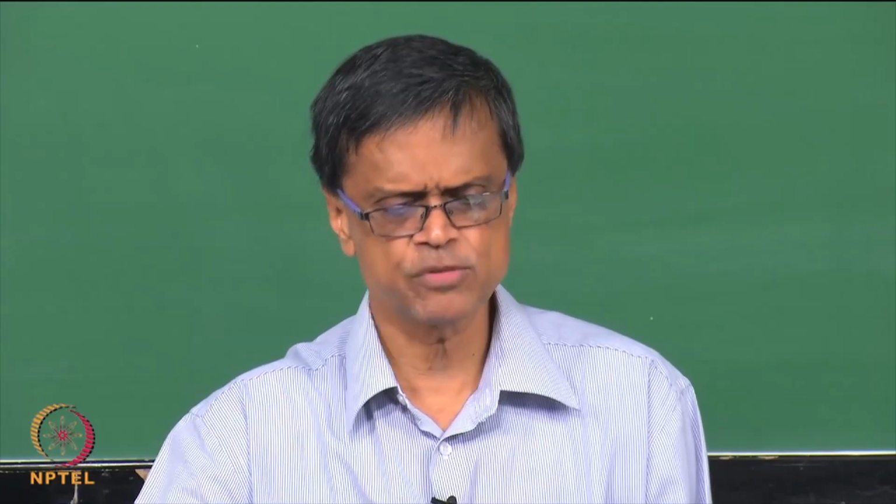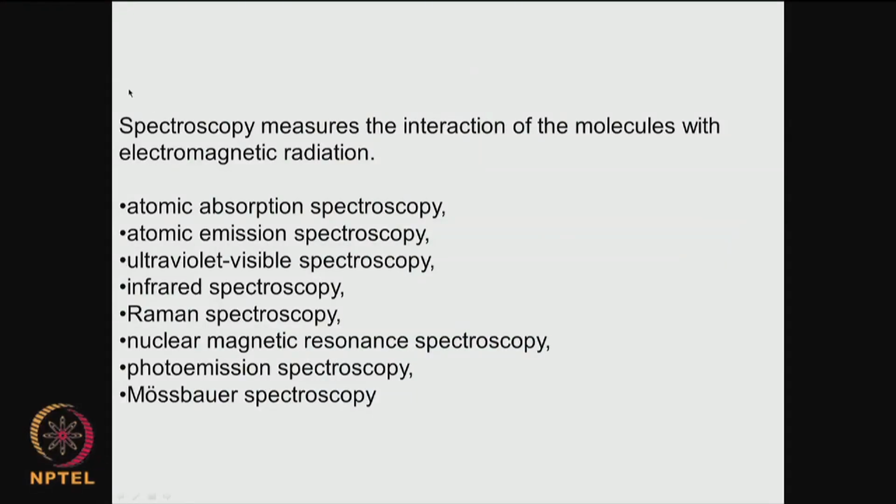So, when we do this on polymers or polymer blends, we understand quite a lot of details: how stable the material is with respect to changing heat, whether they change their phases as well, what the glass transition temperature of the material is. All those details we can try to identify using these types of techniques. Then we have a lot of spectroscopies used in biology.